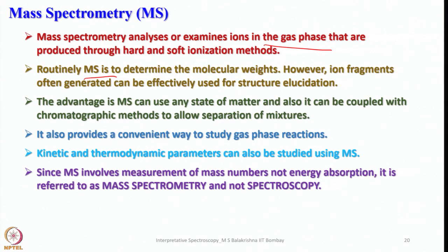Since mass spectrometry involves measurement of mass numbers, not energy absorption, it is referred to as mass spectrometry and not spectroscopy. I repeat, since mass spectrometry involves measurement of mass numbers, not energy of absorption, hence it is referred to as mass spectrometry and not spectroscopy.